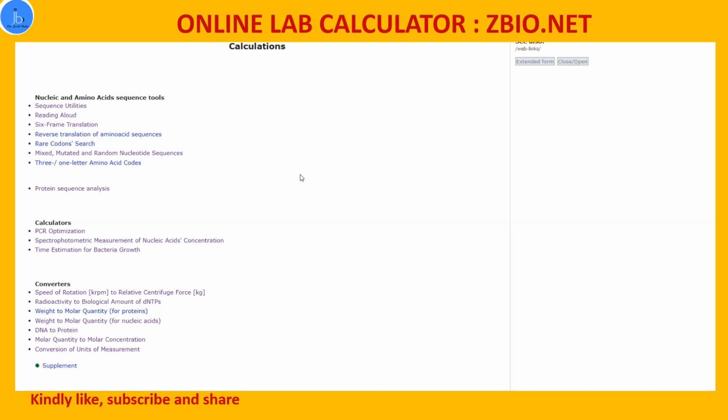So for daily purposes in the laboratory, it will make things very easy, especially as many biologists are a bit phobic to mathematics and computers. It is going to help you while performing simple daily calculations related to your experiments.